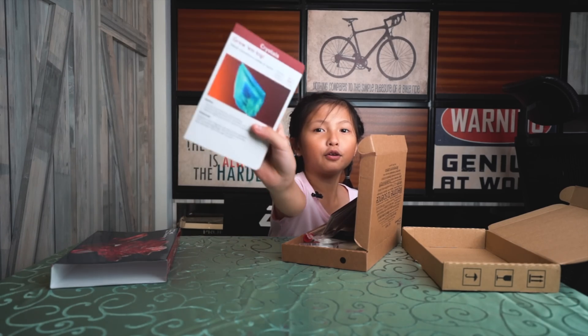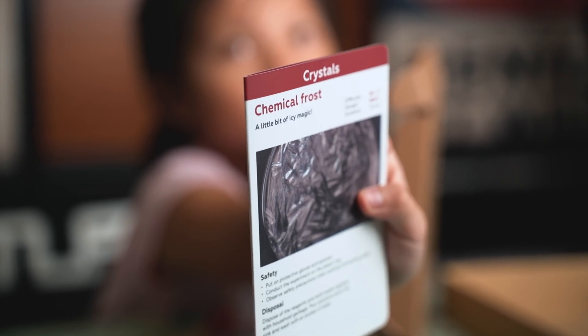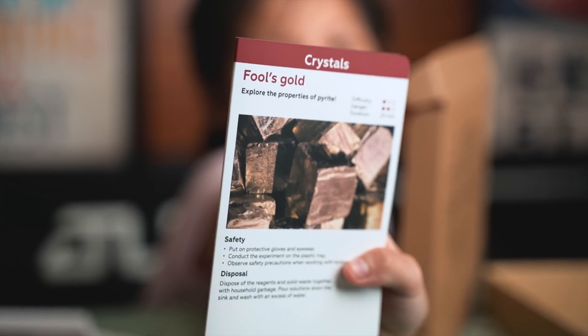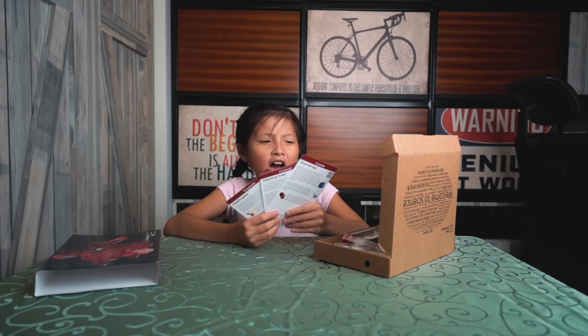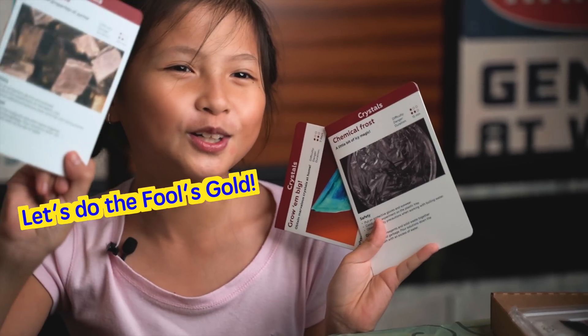We have grow and bake, we have chemical frost, and lastly we have fool's gold. I think, what should I pick? I think I should pick fool's gold.